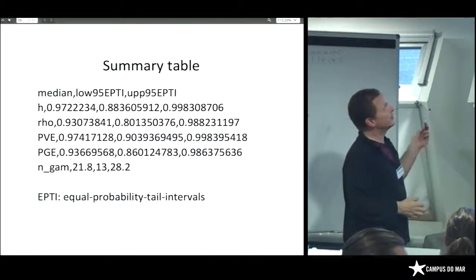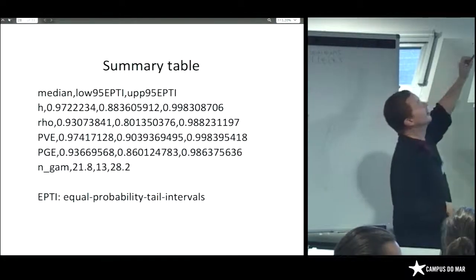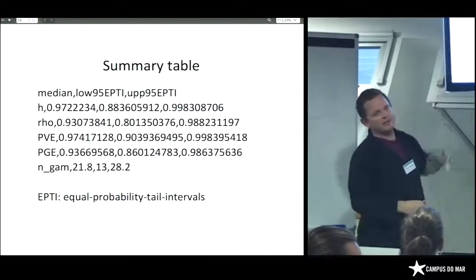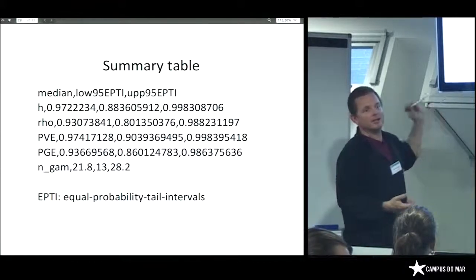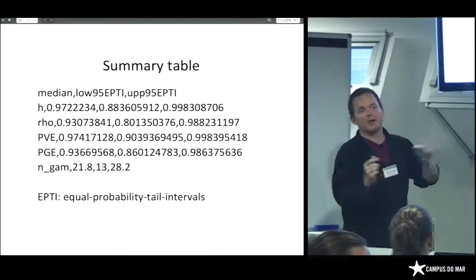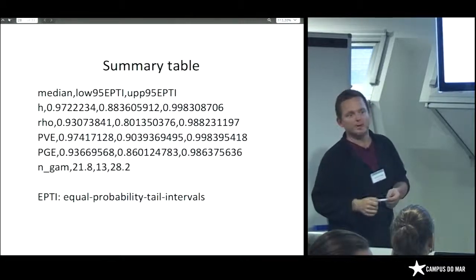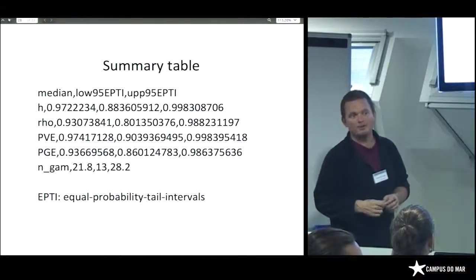There are many other models that you can run. This is just using the Bayesian models that I've been talking about. You just need to use your common sense. If you actually think that your phenotype is that strong, that 97% seems reasonable, the first thing you would do is identify which SNPs have really high posterior inclusion probability, go back to your genotype file, extract that consensus sequence, and BLAST it, and see if it's coming out in a coding region and it's associated with the phenotype in a way that you can plausibly explain biologically.